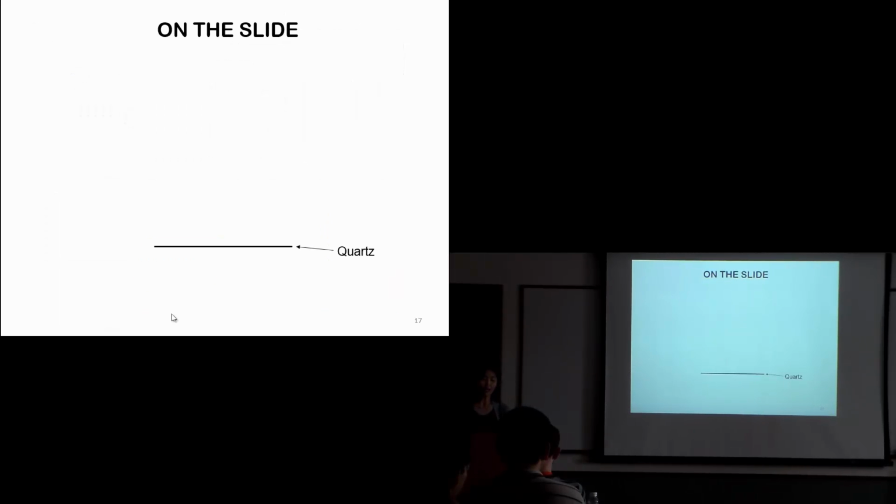All right, so what we actually do on the slide is this. We use a quartz slide. We put down a silane layer, silanize the slide, and then we put down this polymer brush layer made up of polyethylene glycol. And this is crucial for rejecting non-specific binding of sticky proteins. So this takes a long time, but it's worth it when we are working with proteins.